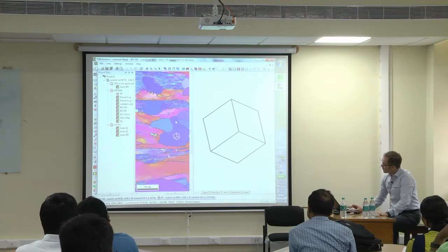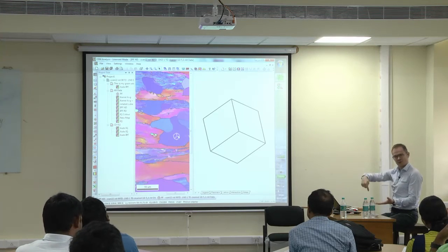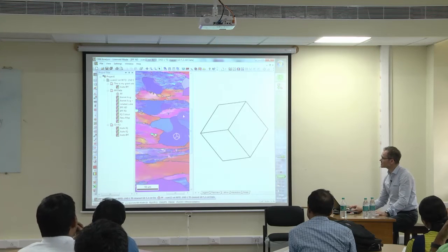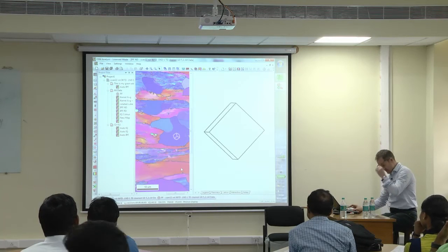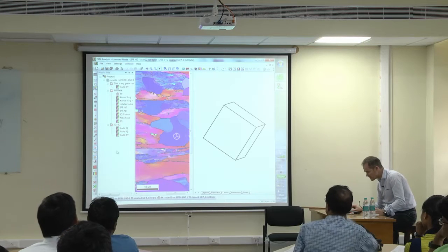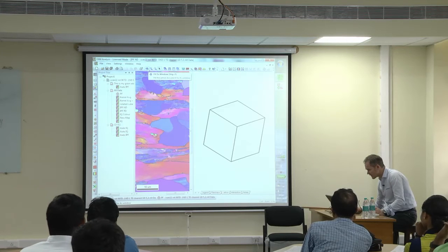Of course, the drawing of this crystal is right, but you must remember, it is like I would observe it from the top. It is no longer related to the morphological data of this grain here. From the top, the grain would look different, no? But I haven't taken that cut. So let me remove that again. Okay, and let's go back to standard size.